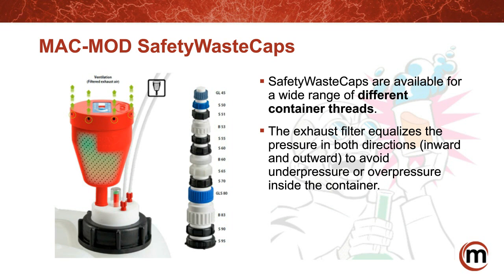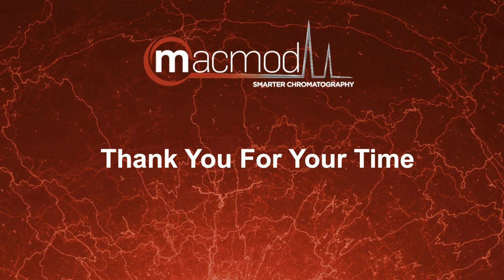And this will be our last question of the webinar. I have a bottle that we purchased from Fisher, which we use for needle washes and seal washes. It has a smaller top than my other bottles. My other lids don't fit it currently. Do you have an adapter or some sort of cap for those types of bottles? Yeah, we have both. We have an adapter, I mentioned it throughout the presentation, called the GL38, and we have just a cap that fits it. So it's really dependent upon what the analyst wants. If you wanted to use your own GL45 cap and just use our adapter, that can work. Or if you want to use just our cap that is specially made for that bottle, we can do that as well.